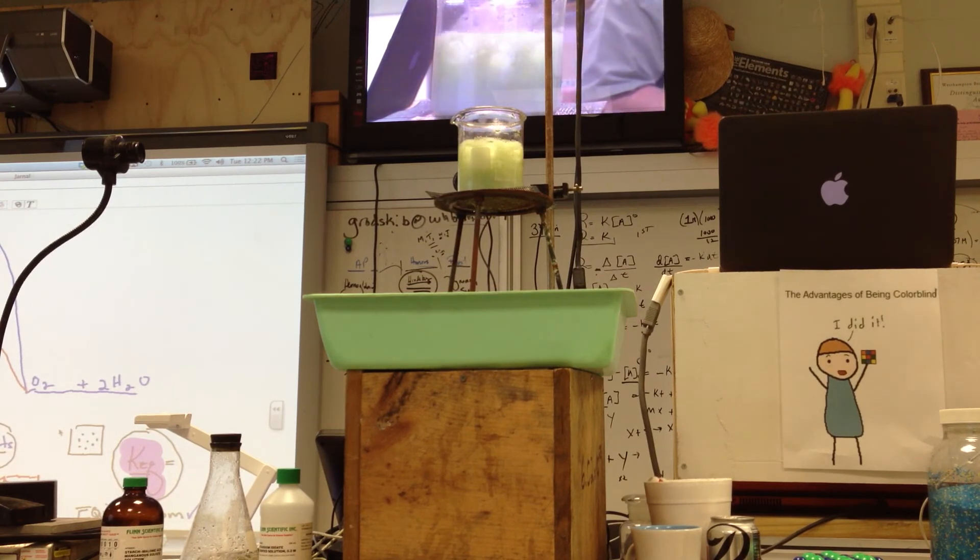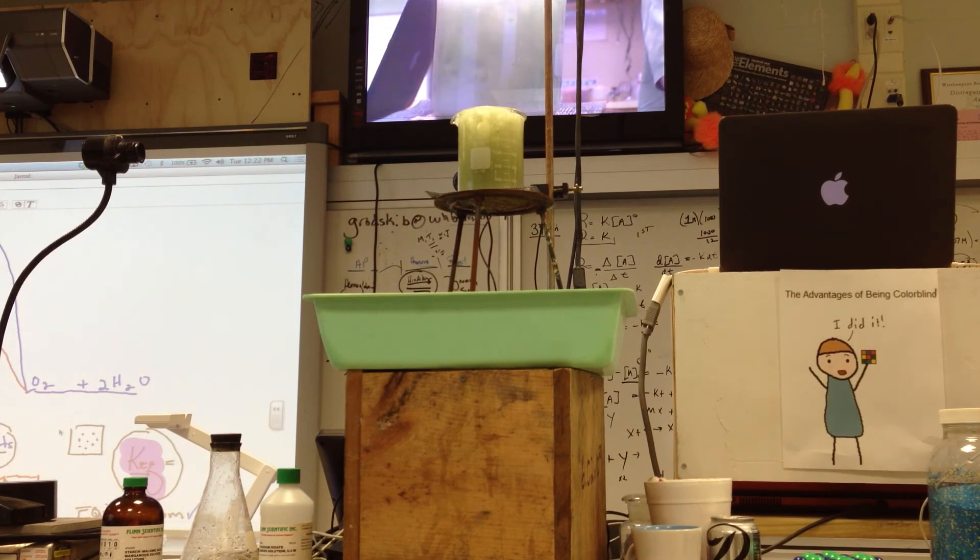Well, it means that it takes it on a pathway, but the last step, the catalyst gets reformed again. Oh, it's going up.